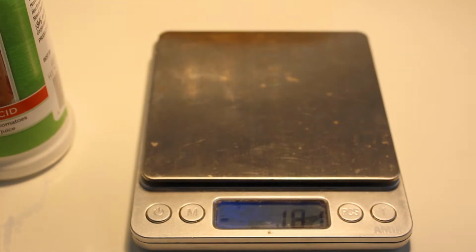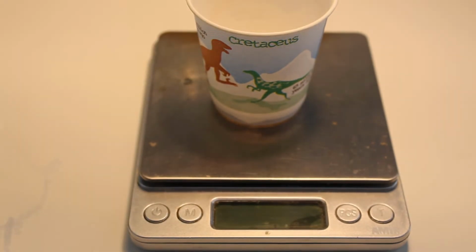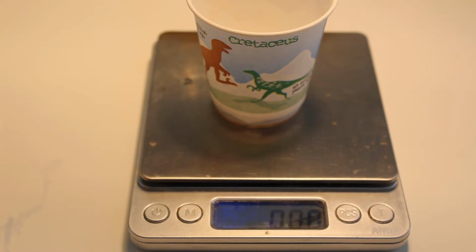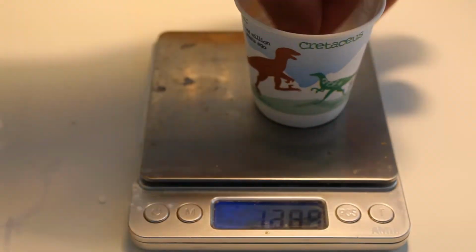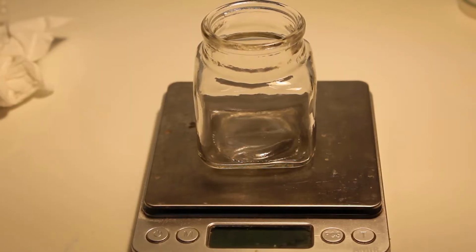And now we have to measure sodium bicarbonate. Okay, next ingredient. Sodium bicarbonate, also known as baking soda. You should be able to find this at any store, supermarket. And for this we will need 12.13 grams of it. Perfection.